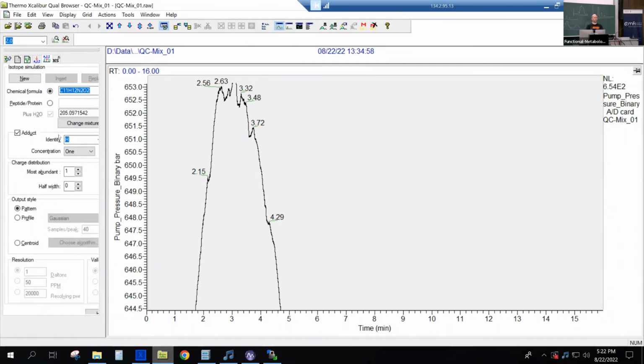It's funny, maybe you can text back if they do not use acetonitrile then. She says that we don't go higher than 95%. Okay. So they use it but not... okay, interesting. Oh, she's also answering. Maybe try to change the composition of your eluents.